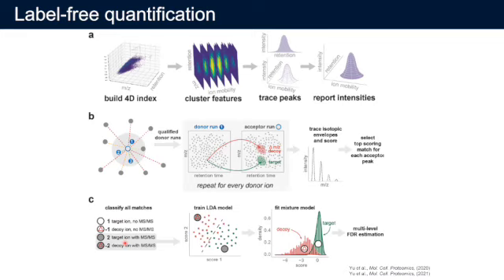And then there's another one, -2. The -2 peptide is a transferred decoy peptide, but it has an MS2 match in the accepted run. Since it has an MS2 match in the accepted run, but we know that the transferred peptide has a very big M/Z shift, this type of ion is very likely to be false. So with these 2 high-confidence positive and negative ion types, we can build an LDA model to do the scoring.